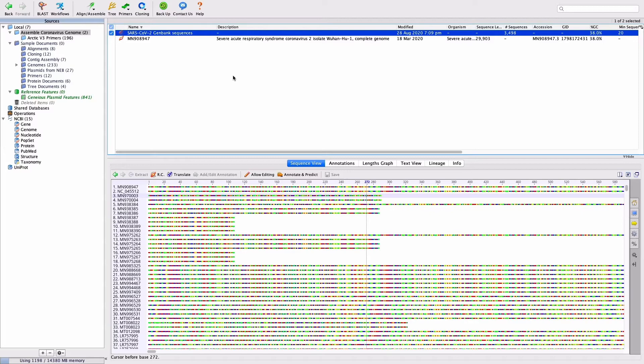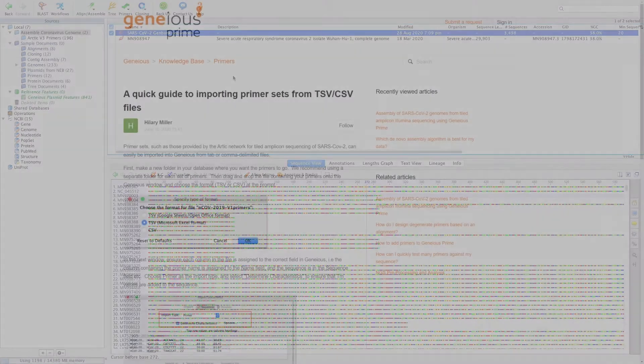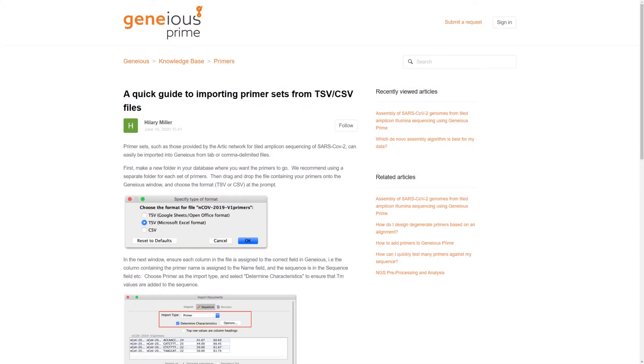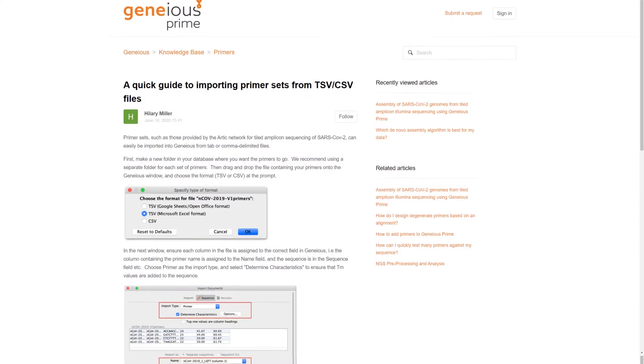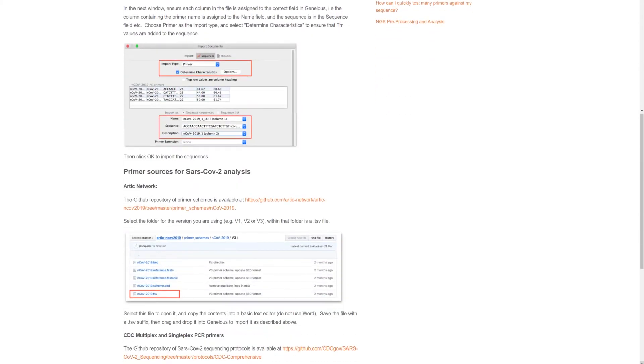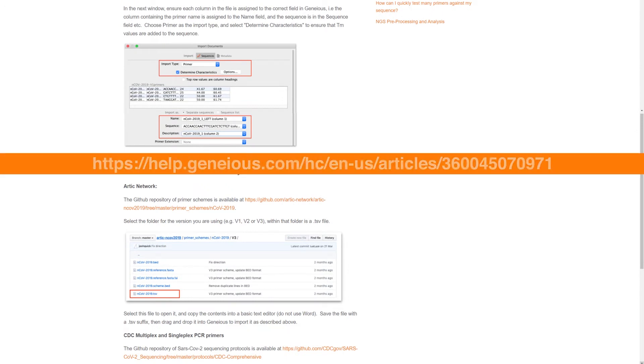Prior to running BB Duck, the set of primer sequences used in sequencing must be imported into Geneious, so that these can be selected for adapter trimming. A guide to importing Arctic Network and other tiled amplicon sequencing primer sets from CSV or TSV files is at this link.